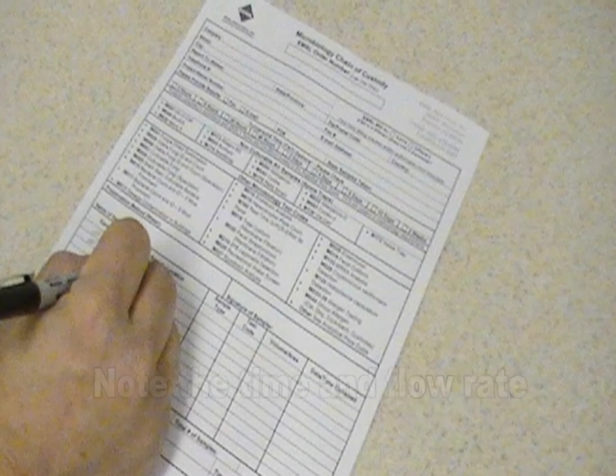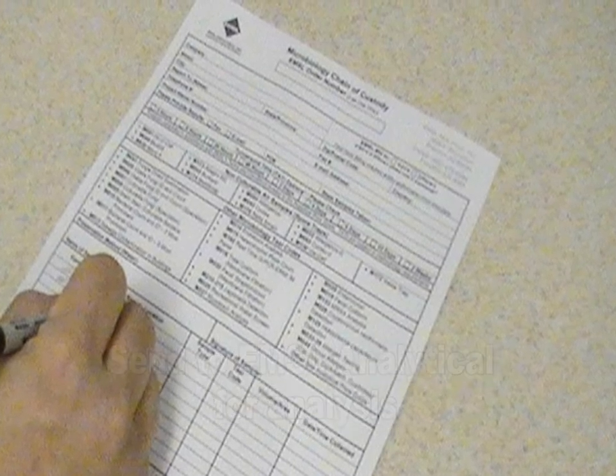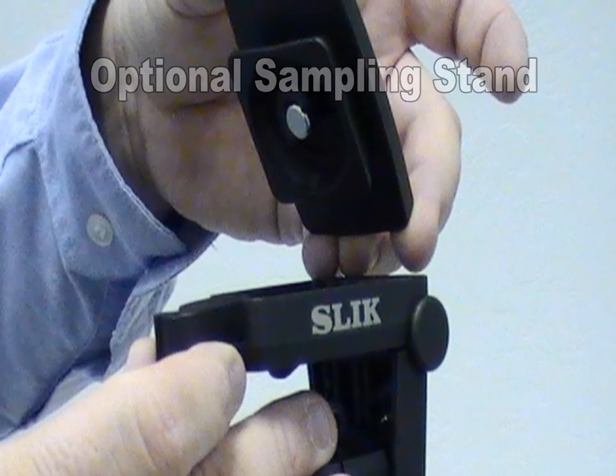Be sure to note the time and flow rate on the chain of custody form. Then place the cassette in the Ziploc style bag and ship to EMSL Analytical for analysis.